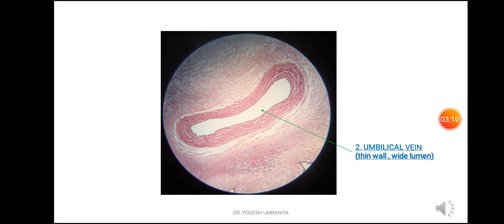This is the closer view of the umbilical vein. You can see the lumen is not circular as compared to the umbilical arteries, and the lumen is somewhat collapsed. The wall of the umbilical vein is thin as compared to the umbilical arteries, and the lumen is quite larger, wider, and more spacious as compared to the umbilical arteries.